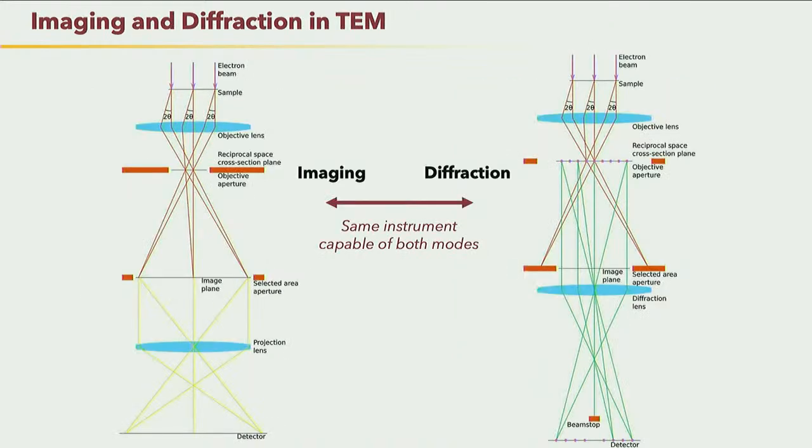Now I just want to bring this point up too. This gets lost a lot of times for people who aren't familiar with the technique, and that is that the machine we use is essentially the same machine you'd use for single particle cryo-EM. Nowadays they're coming up with new diffraction-specific electron microscopes, but for the most part, we use electron microscopes that are also used for imaging.